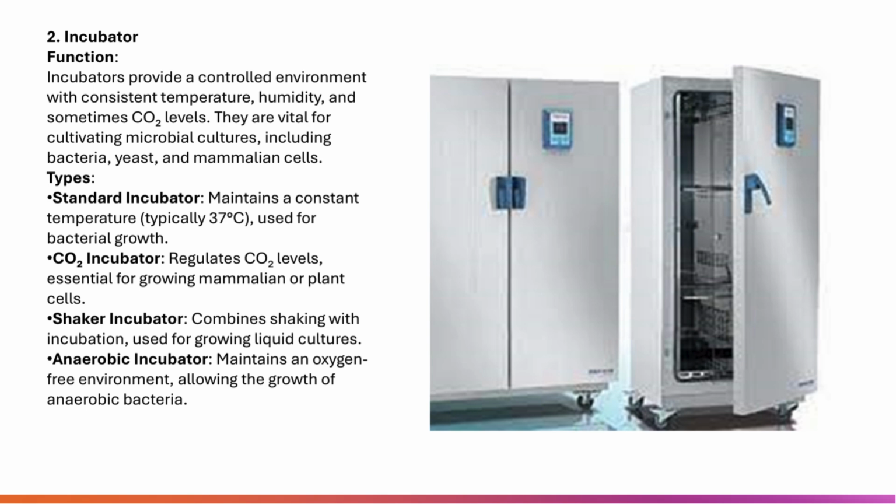CO2 incubator. For mammalian or plant cells, the CO2 incubator is the go-to tool. It regulates CO2 levels, ensuring that cells grow in conditions similar to those in the human body or plant tissues. This is especially crucial for growing cells that rely on specific CO2 concentrations for proper metabolic functions.